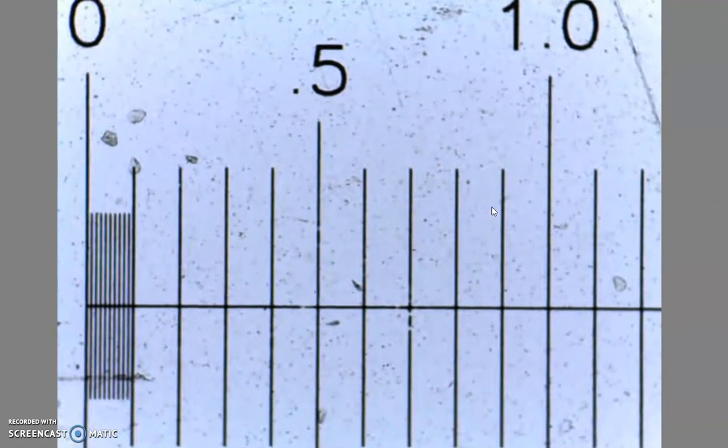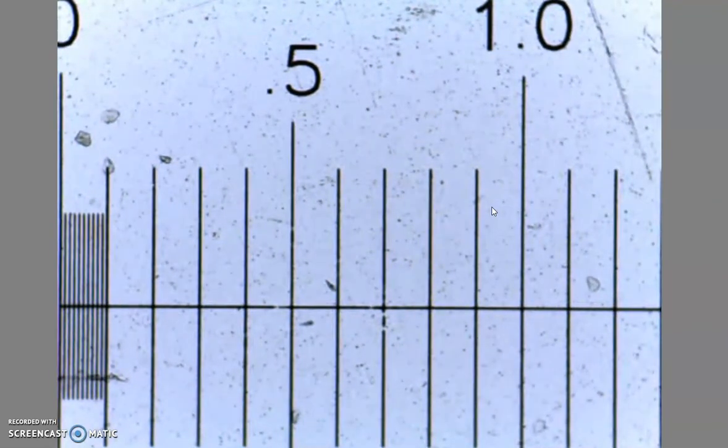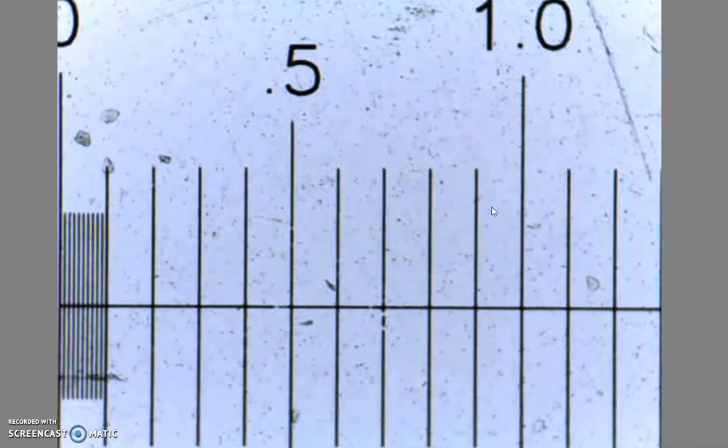The camera and I are fighting right now. All right, so that's about there. And then you're going to measure how big this is. You're going to literally count how many lines there are, right? So if this is 0, here we have 1, 2, 3, 4, and 5, right? Here's your 0.5, 6, 7, 8, 9, 10 to 1, and then 1, 2, 3. So this has 13 lines where it is 1.3 millimeters in diameter.